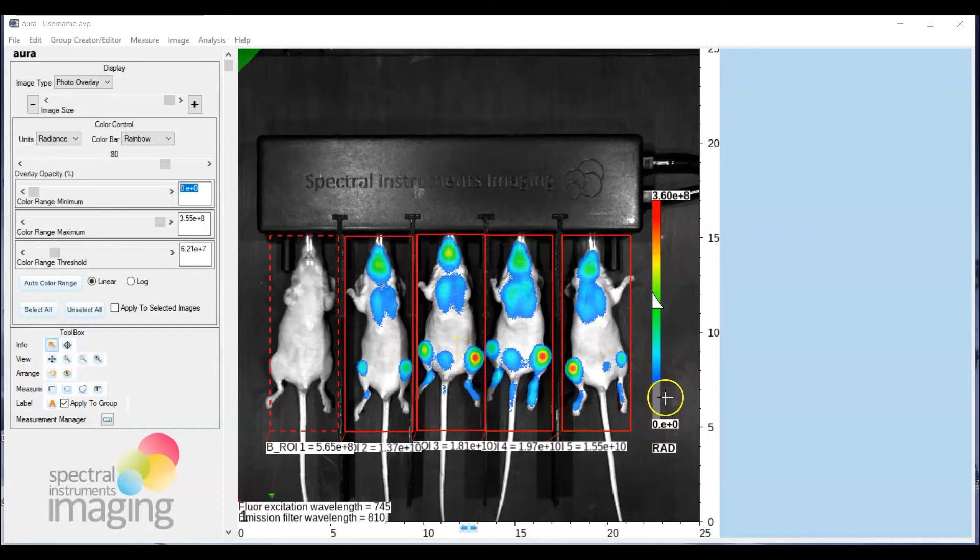So to find the threshold, simply go over to the display features. And you'll note that we have both the color range min and max of the calibration bar, and we also have the color range threshold.